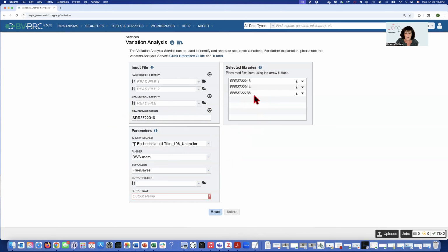These are going to align these reads and look for SNPs against this particular genome. Now, because these samples were evolving in real time, when I use the aligner, and you know, we have BWA mem strict, Bowtie2, LAST, and Minimap2.